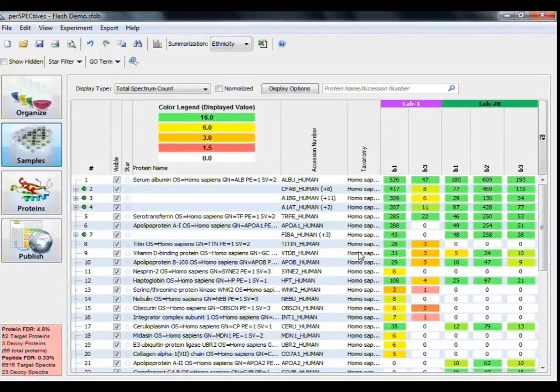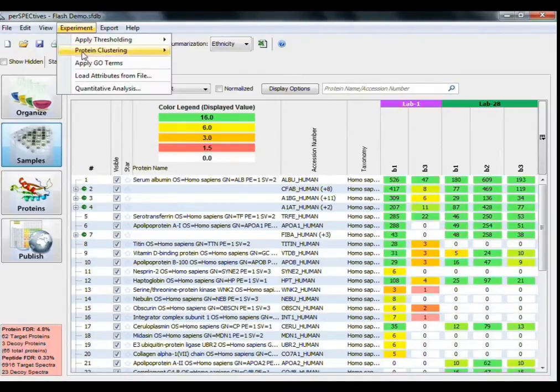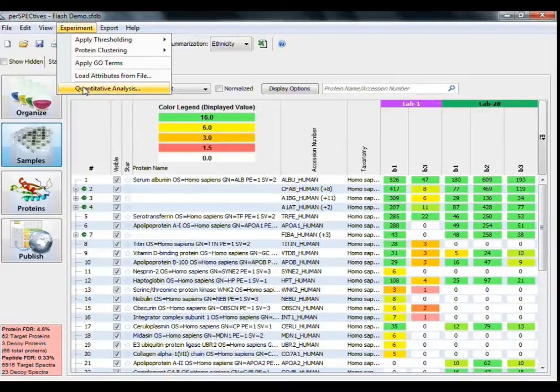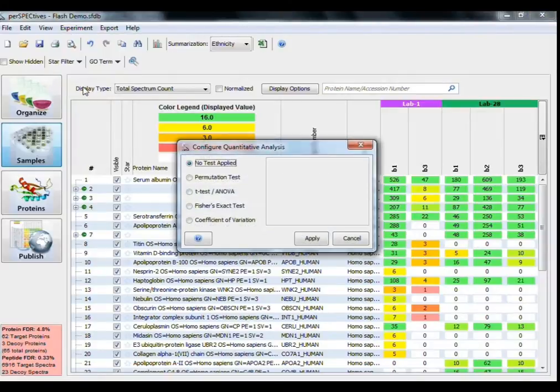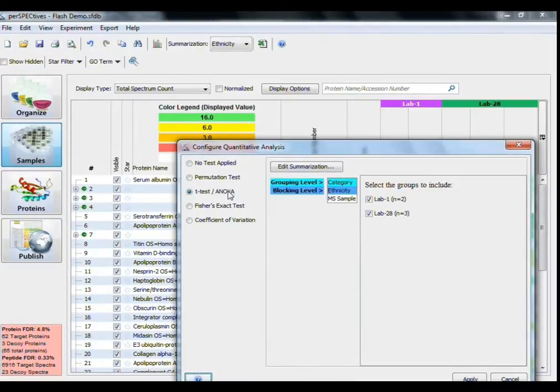I also want to apply a t-test to my data, which I can do through the Experiment drop-down menu here. Click Quantitative Analysis to bring up the Configure Quantitative Analysis dialog box, where you can choose from a variety of statistical tests. I'm going to select the t-test.